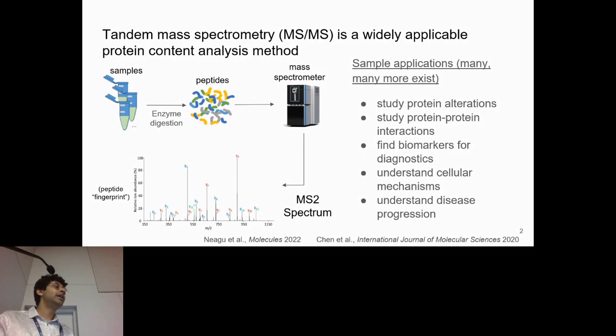This piece of data is associated with a peptide, and you can use this information to quantify what exactly was in your sample to begin with, which has a plethora of uses, many of which are obviously not on the slide. But as most of you know, there are a lot of reasons you want to figure out what's exactly in that animal soup you had at the beginning there.